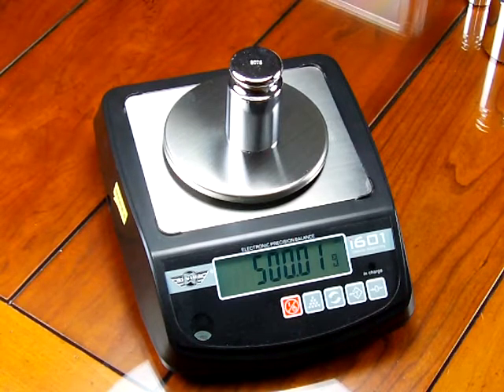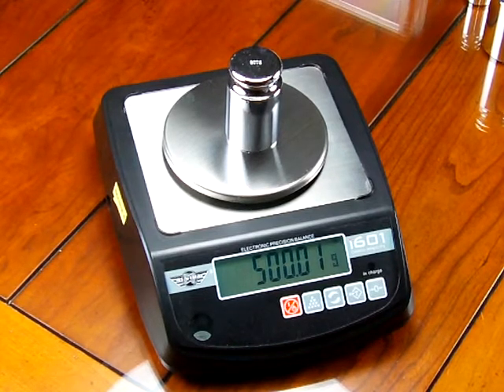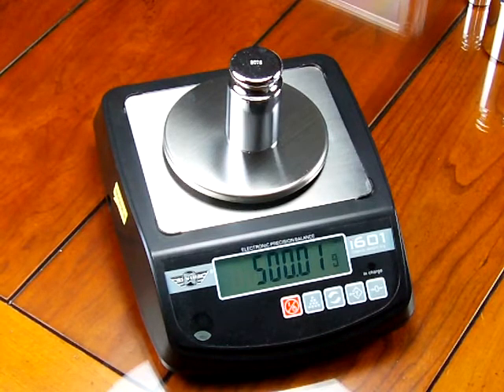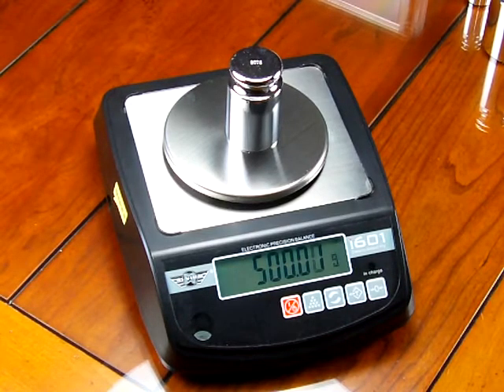and we have a full line of calibration weights. If you'd like to purchase the MyWay i601, we have these in stock at balances.com, or visit our website, scaleman.com.